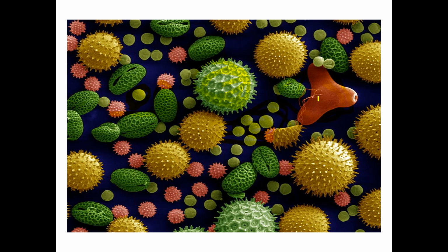All these details can be visualized using electron microscopy, and especially in the scanning electron microscope, you can observe the three-dimensional structure, how it looks like. Clear? So that's all about the electron microscope, that's all about the unit microscopy.